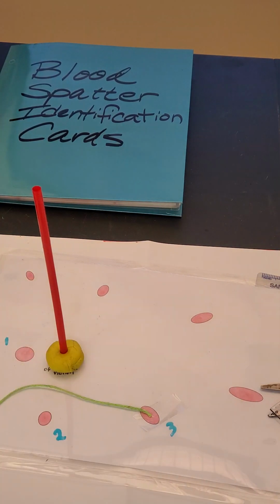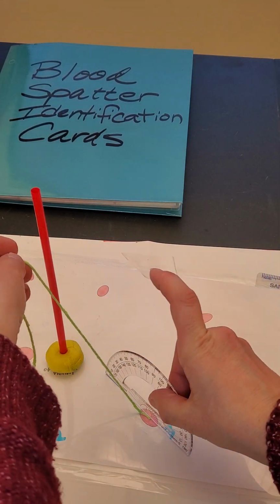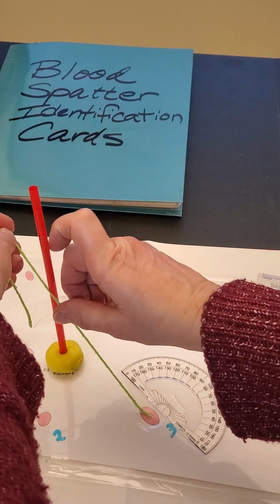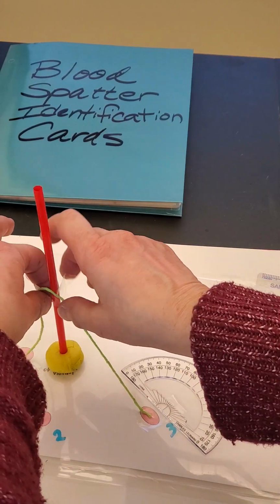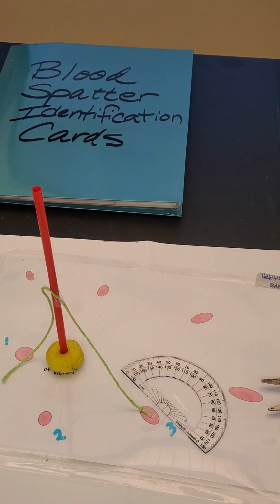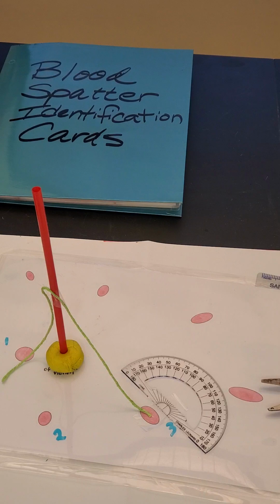Make sure that it's straight. And once you find out where the location is, go back, take the piece of tape, make sure that's as exact as it possibly can be, and then just tape it gently to the straw. You don't have to cut off the extra piece, that's fine. But you're going to do that for all of the blood drops.